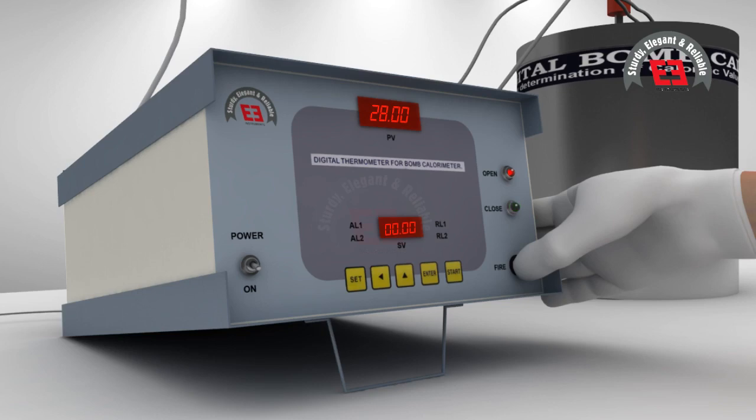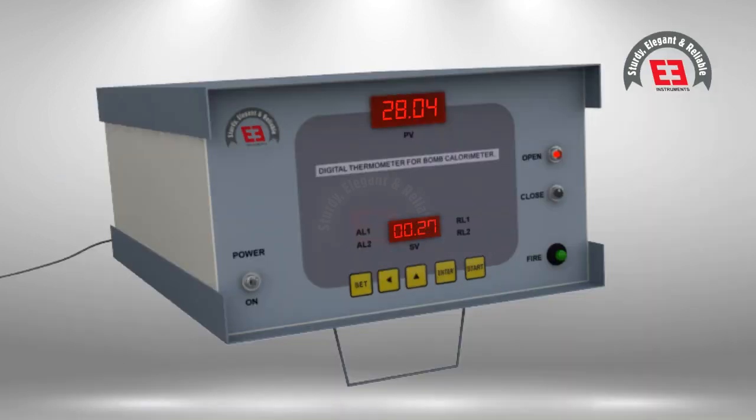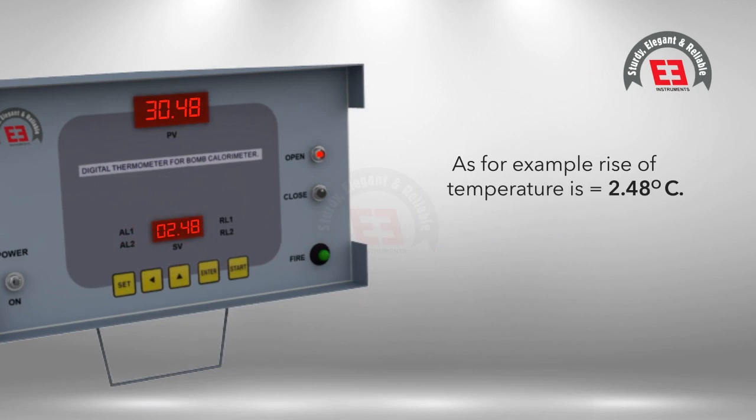Press the push button switch for a few seconds to fire, and observe the increment in temperature value in the lower display. Observe the rise of temperature to the maximum value, allow it to stabilize, and as soon as the temperature starts to decrease, note down the maximum rise of temperature. For example, the rise of temperature is 2.48 degrees Celsius.